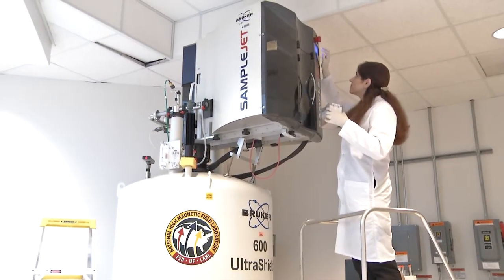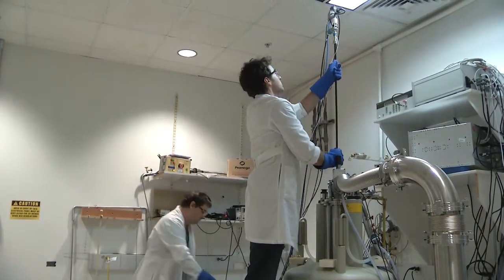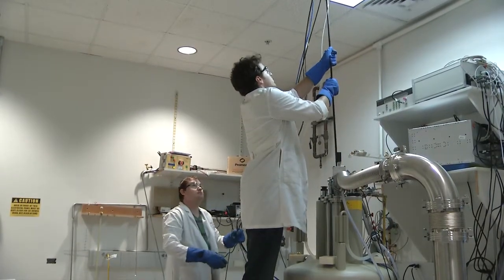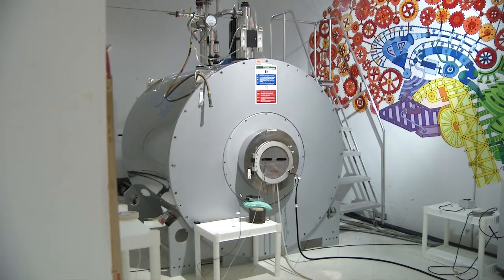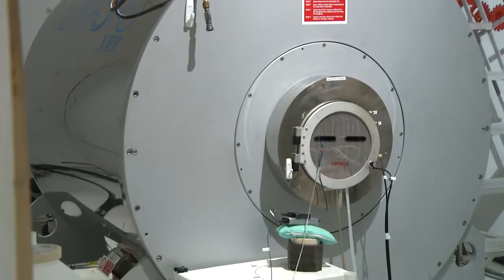We're really interested in taking this technology to the next level in terms of studying metabolism in vivo. But I'm also working on a new technique called dynamic nuclear polarization. What this essentially allows us to do is to take a molecule of interest that we know is important in a particular metabolic pathway and enhance its signal 10,000-fold, so that essentially we're searching for a needle in a haystack, but now the needle has a much, much stronger signal than any of the hay in which it's found, so we can track it in real time in a living organism.